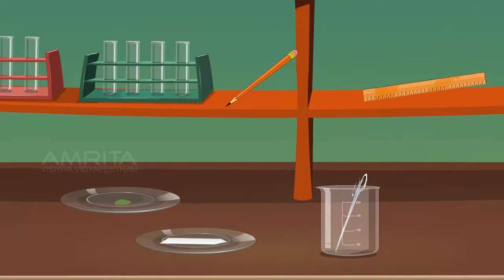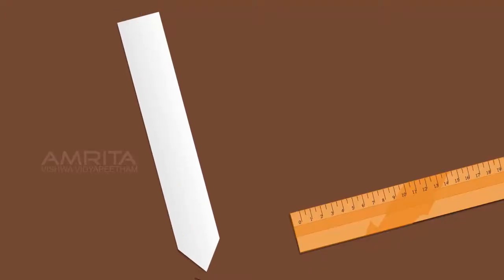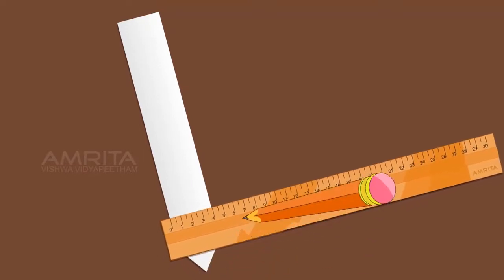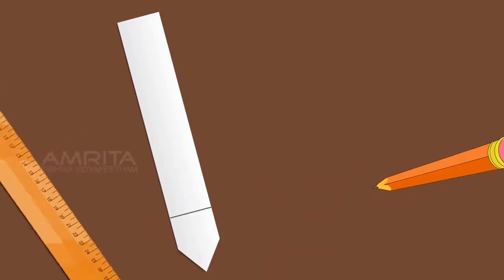Take a filter paper strip with a narrow notch at one end of the strip. Using a pencil and scale, draw a horizontal line about 2-3 cm away from the tip of the notch.